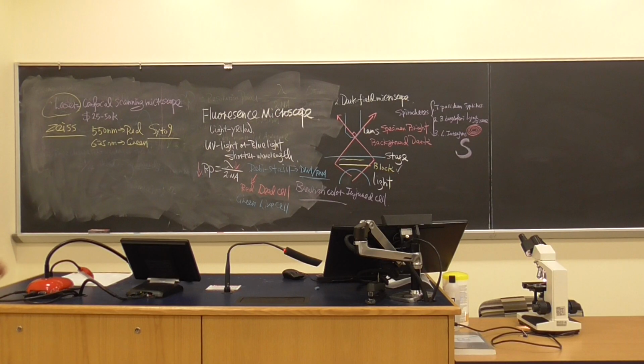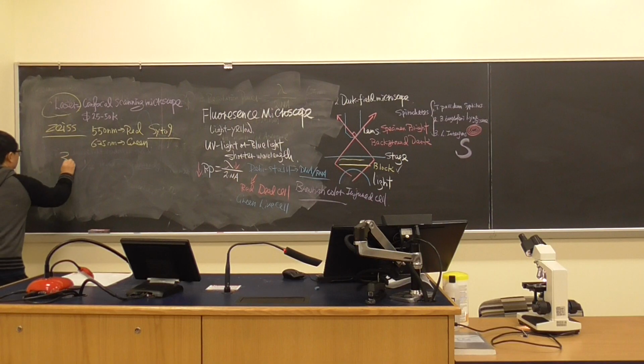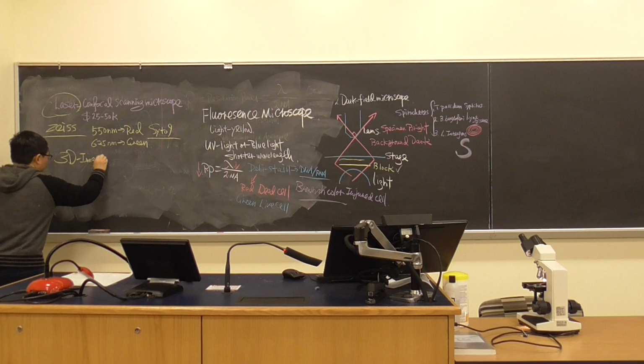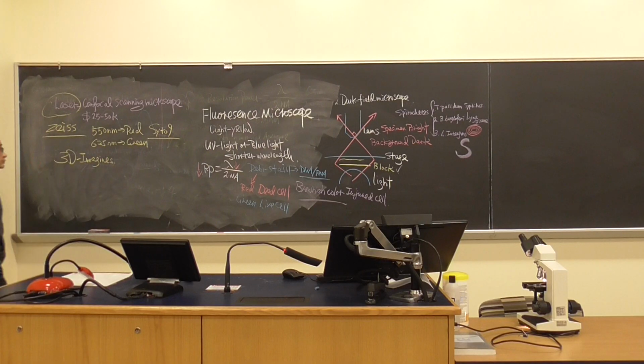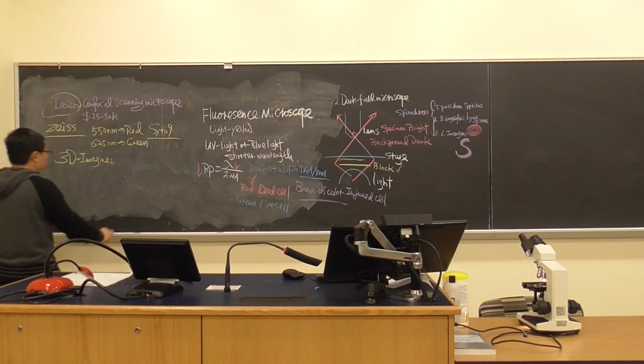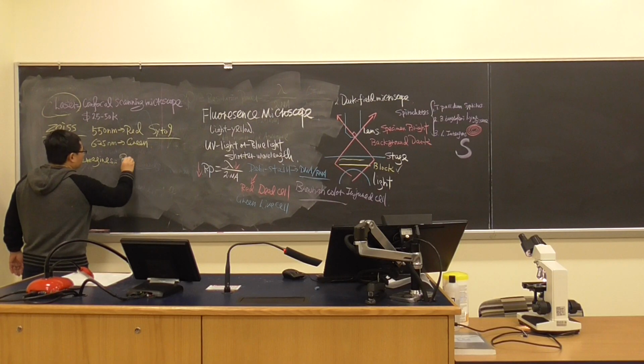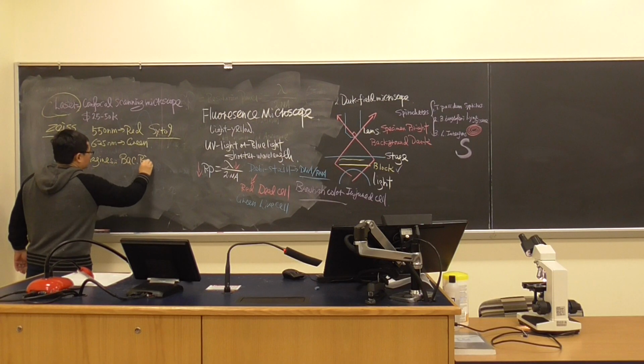But what's special? With the laser confocal scanning microscope, you could see 3D images. This is important. We not only see the first surface, we will see the length, width, and how high it is. Why? Because the laser confocal microscope is used to observe a very special bacteria structure called the bacteria biofilm.